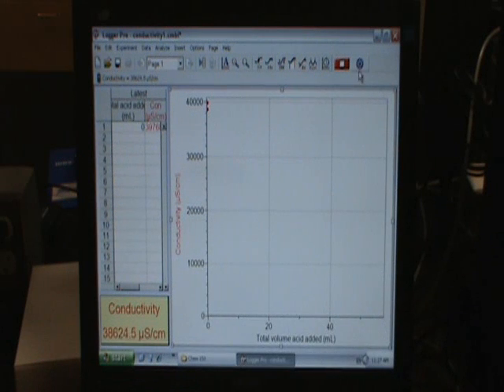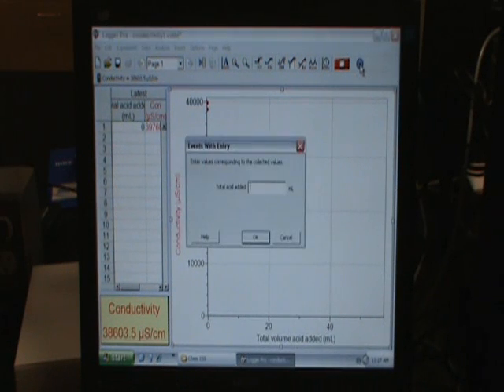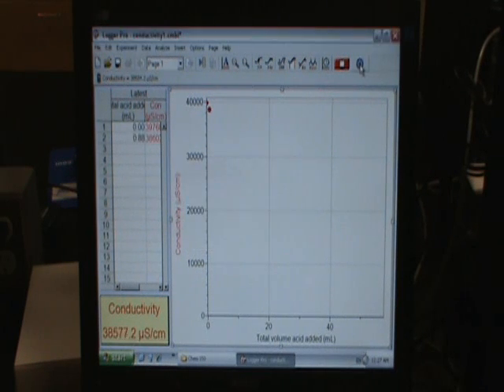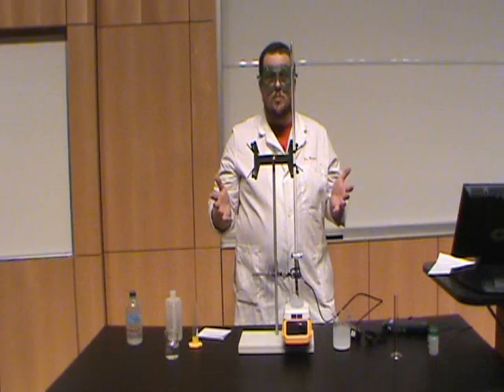Go to the computer. Now I can go over here and click keep again and tell it 0.88 milliliters has been added. And I've started doing my experiment. Now we're ready for our next point.